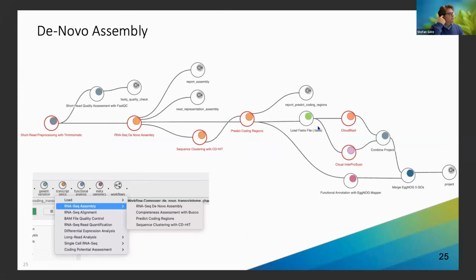And for a de novo assembly study, we would not use an aligner, but an assembly tool. So we would use Trinity, for example. So you can set up those pipelines in OmicsBox, but what we normally recommend when doing something from scratch or new is to go step by step. So I put here again the Trimmomatic and the FastQC step, which sometimes you have to go around a couple of times until everything looks good.